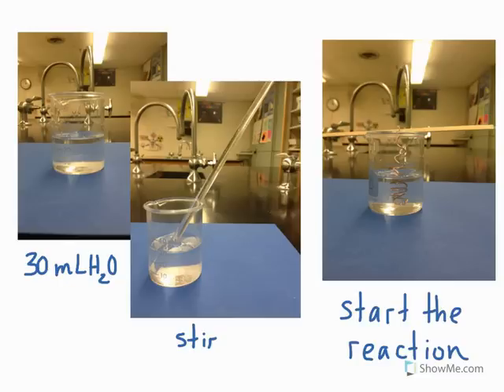Fill the beaker to the 30 milliliter mark with distilled water and stir the solution with the stir rod until all the solid silver nitrate has dissolved. Rinse the stir rod with distilled water and then start the reaction by placing your copper wire on the wooden splint into the beaker as shown here.